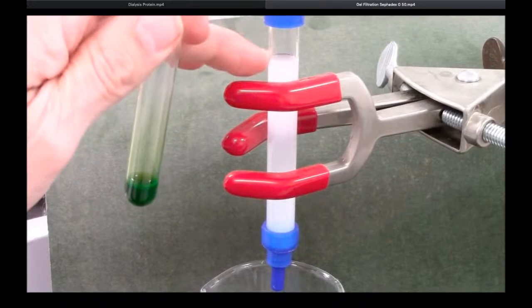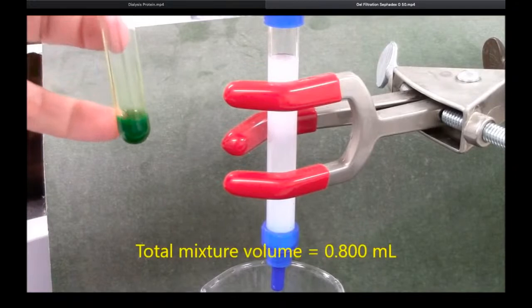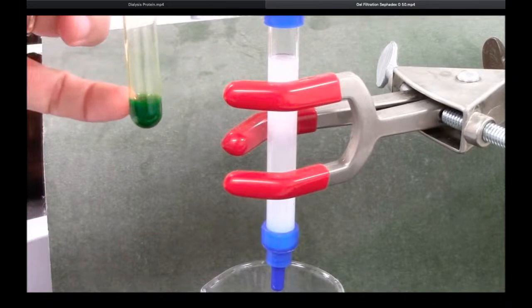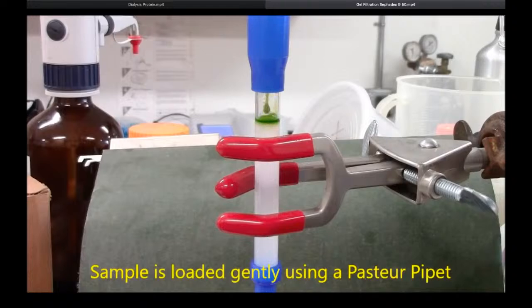I've drained the buffer, so now there's no residual buffer on top of the gel, and I've made a mixture of a total of 0.8 milliliters, 400 microliters of the fluorescein, 400 microliters of the blue dextran, nice green color. I'll separate these on my gel. For this size column, this is getting near the maximum I would put on the column. I'm using a Pasteur pipette to gently load my material onto the column without disturbing the gel bed.